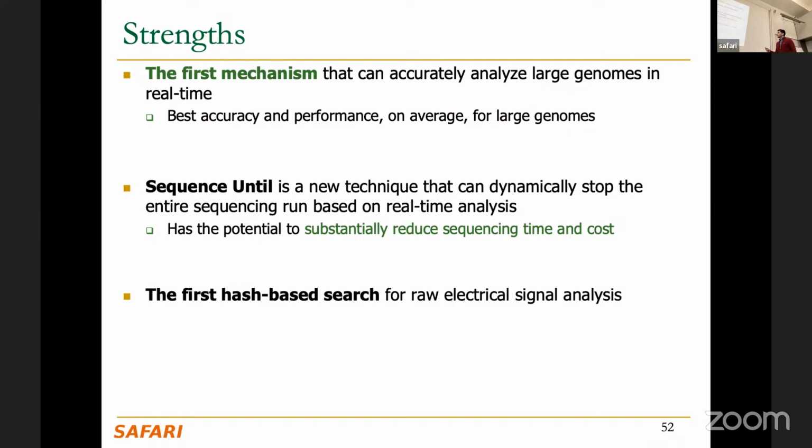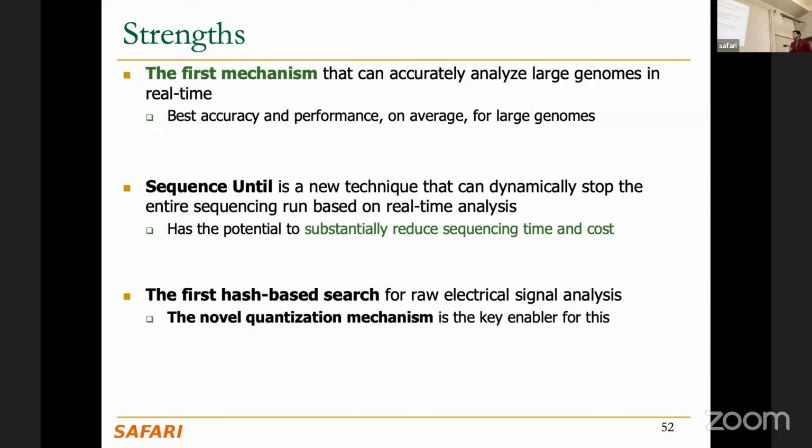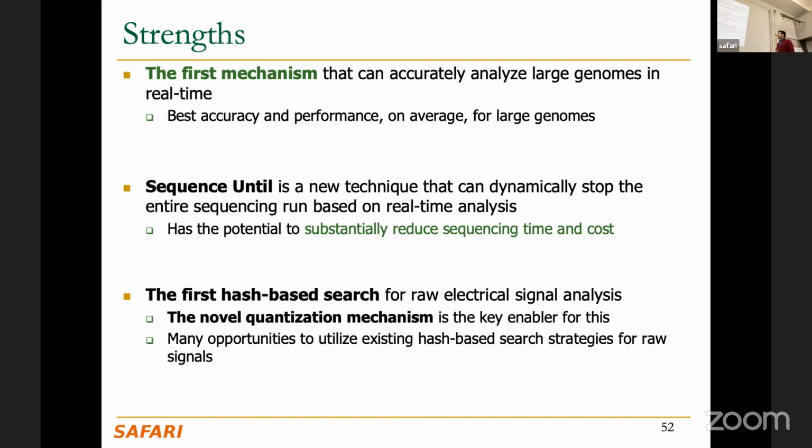The other strength that I see in this paper is that it provides the first hash-based search mechanism for raw electrical signal analysis, and achieving this is enabled by the novel quantization mechanism. This also tells us that there are many opportunities in this first hash-based search mechanism.